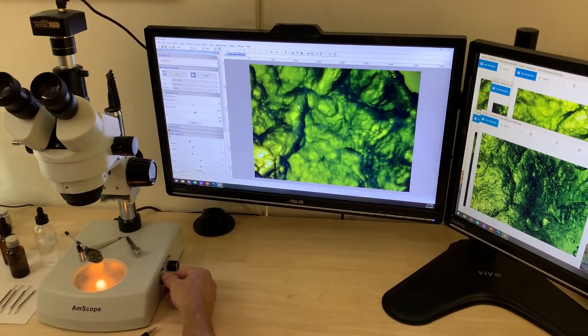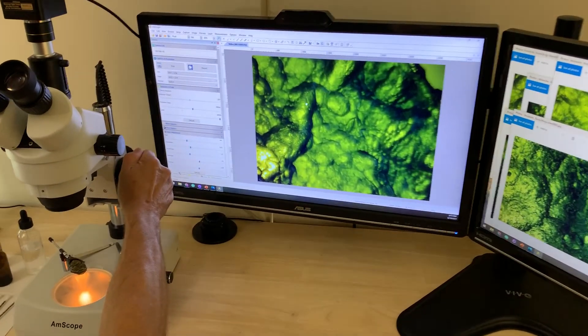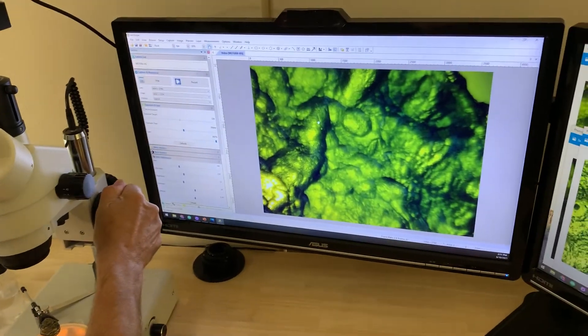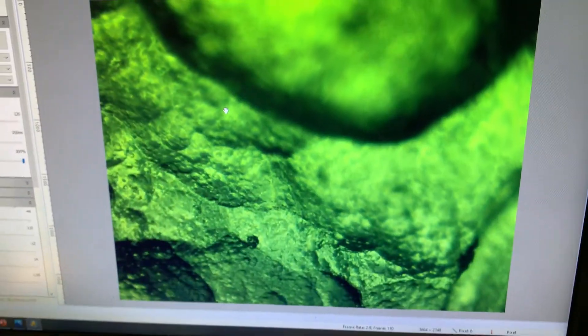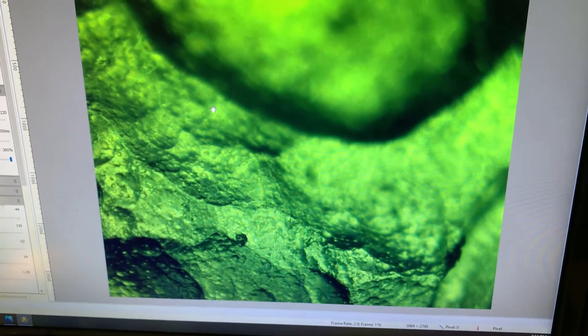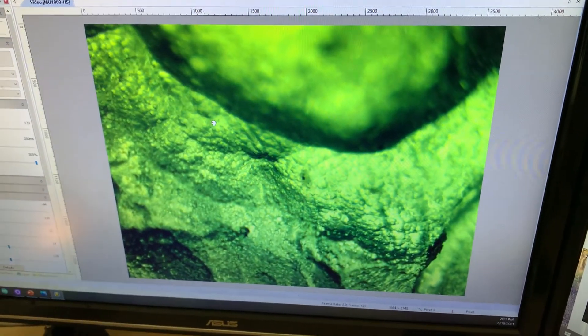I can move it around a little bit and you can see different areas. What you're really seeing here is the surface texture.